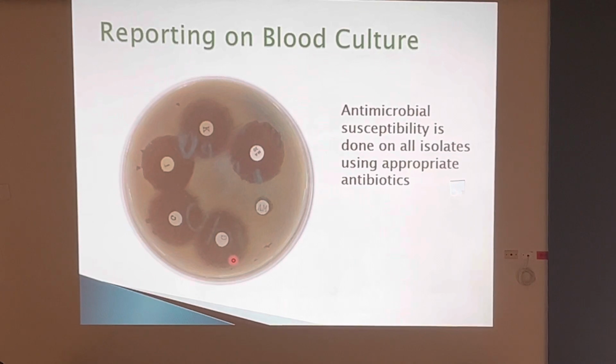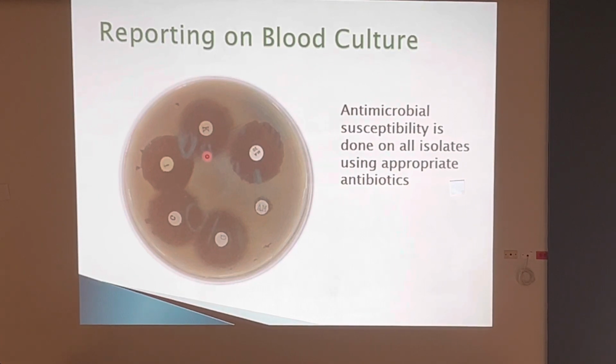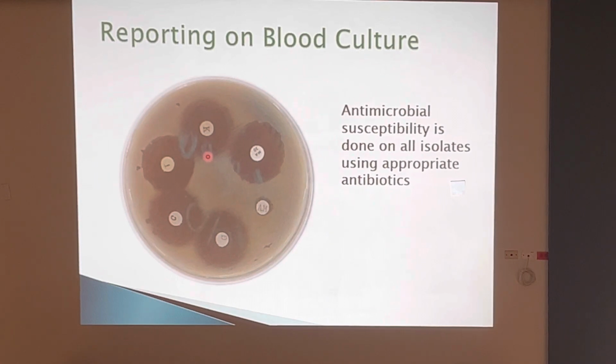Now, as soon as the antibiotic disc touches the agar plate, it starts to diffuse into the agar. Cover that, place it into the incubator, 18 to 24 hours, and then we're going to read. And what we're looking for are termed zones of inhibition. So, from this point of growth here, straight through the center of the disc, all the way to the other side of growth, that is, we're measuring the diameter, and we're going to compare that to our standards in the laboratory to determine whether or not the organism is susceptible or resistant to that particular antibiotic.